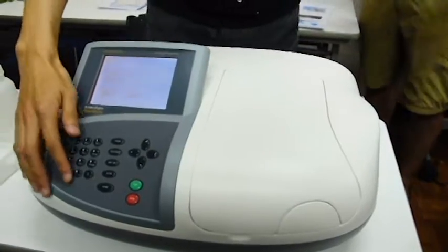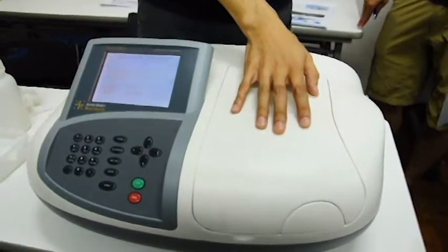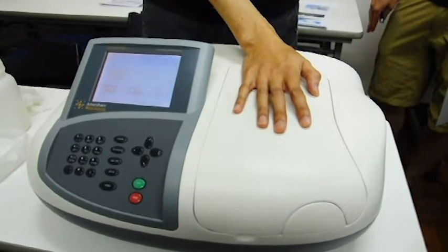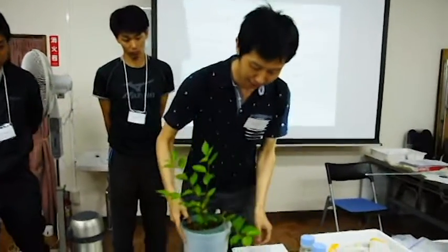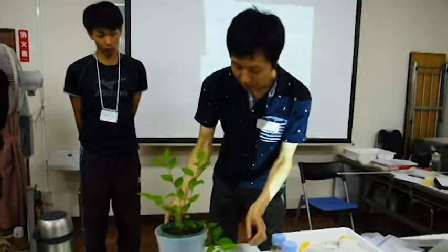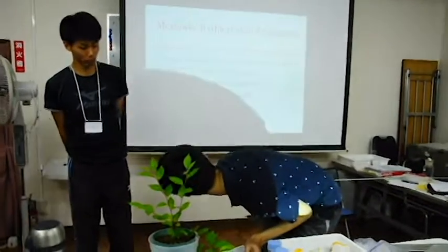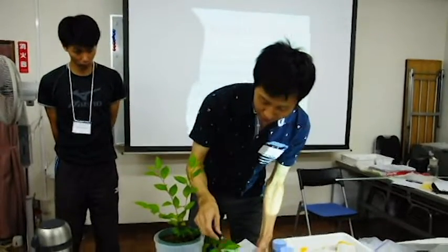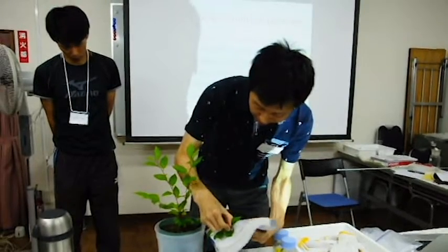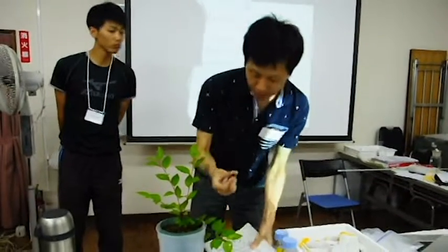Sample number 2: 0.604. And number 3: 0.354. Right? Can the next, please, put the first sample, and if this with like this, here.